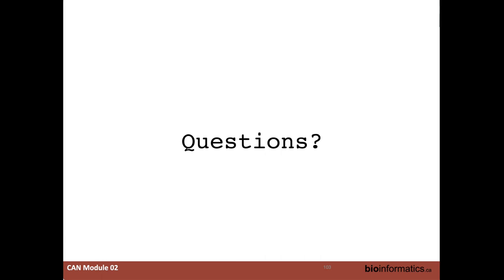Richard, you showed that the FASTQ info is actually in the BAM file, right? So if you can't get the original FASTQs, often you can use a program called BAM to FASTQ and re-extract all the reads and then do your own alignment. There's only one caveat, which is that sometimes, and you can see this in the PG line of the header, the parameters used for alignment make it such that they don't report, let's say, unaligned reads. Then the FASTQ that you extracted would not match the original FASTQ. So you just have to be aware of exactly what was done to generate that file, but you can usually regenerate the FASTQ.